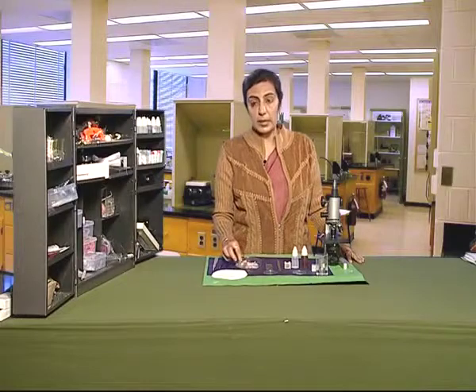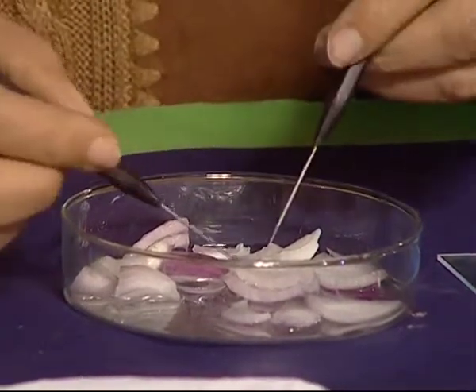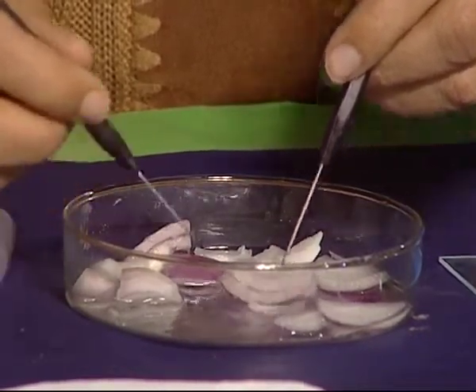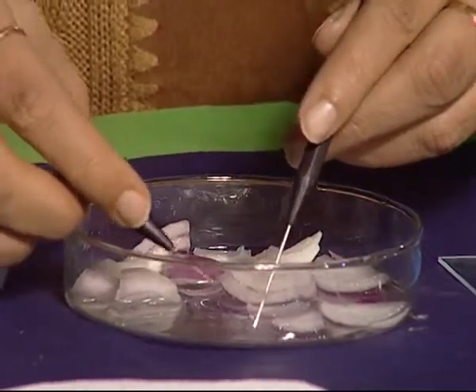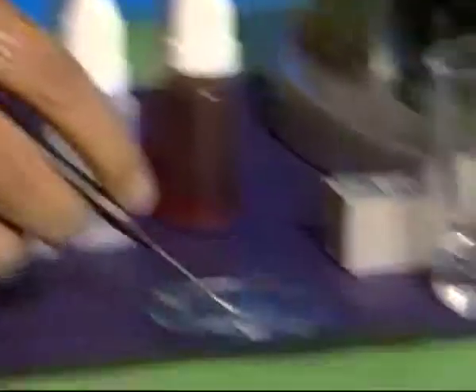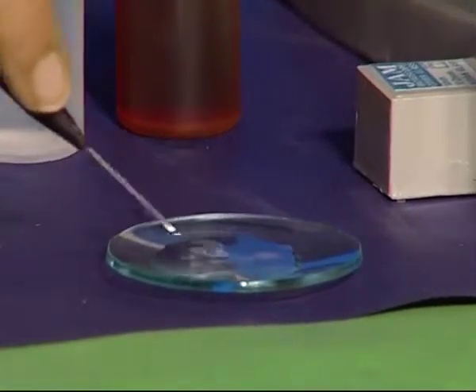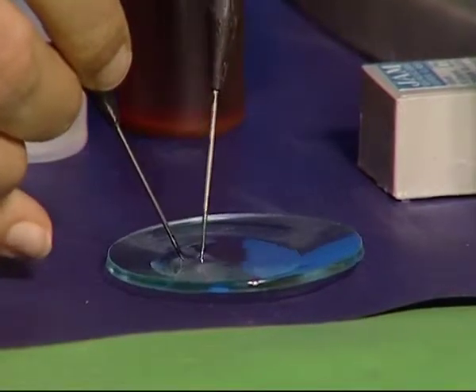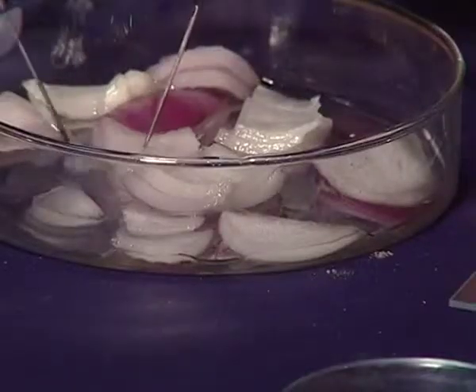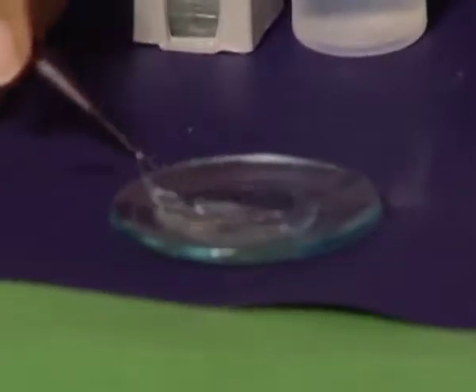We cut the onion and put it in water. Then, with the help of forceps or a needle, we remove the peel from the fresh bulb of the onion. Take this and put it in the watch glass containing some water. Ensure that the peel does not fold. We can take two to three peels and select one of them.